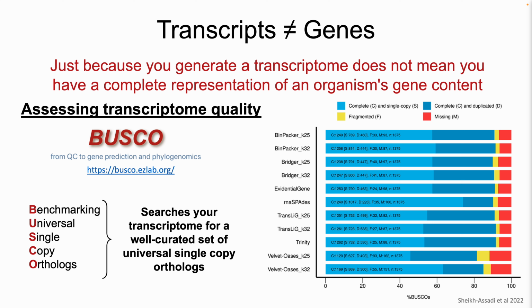What does that mean? Same orientation in the genome sense. So you can look to see if this transcript actually occurs twice in my genome.